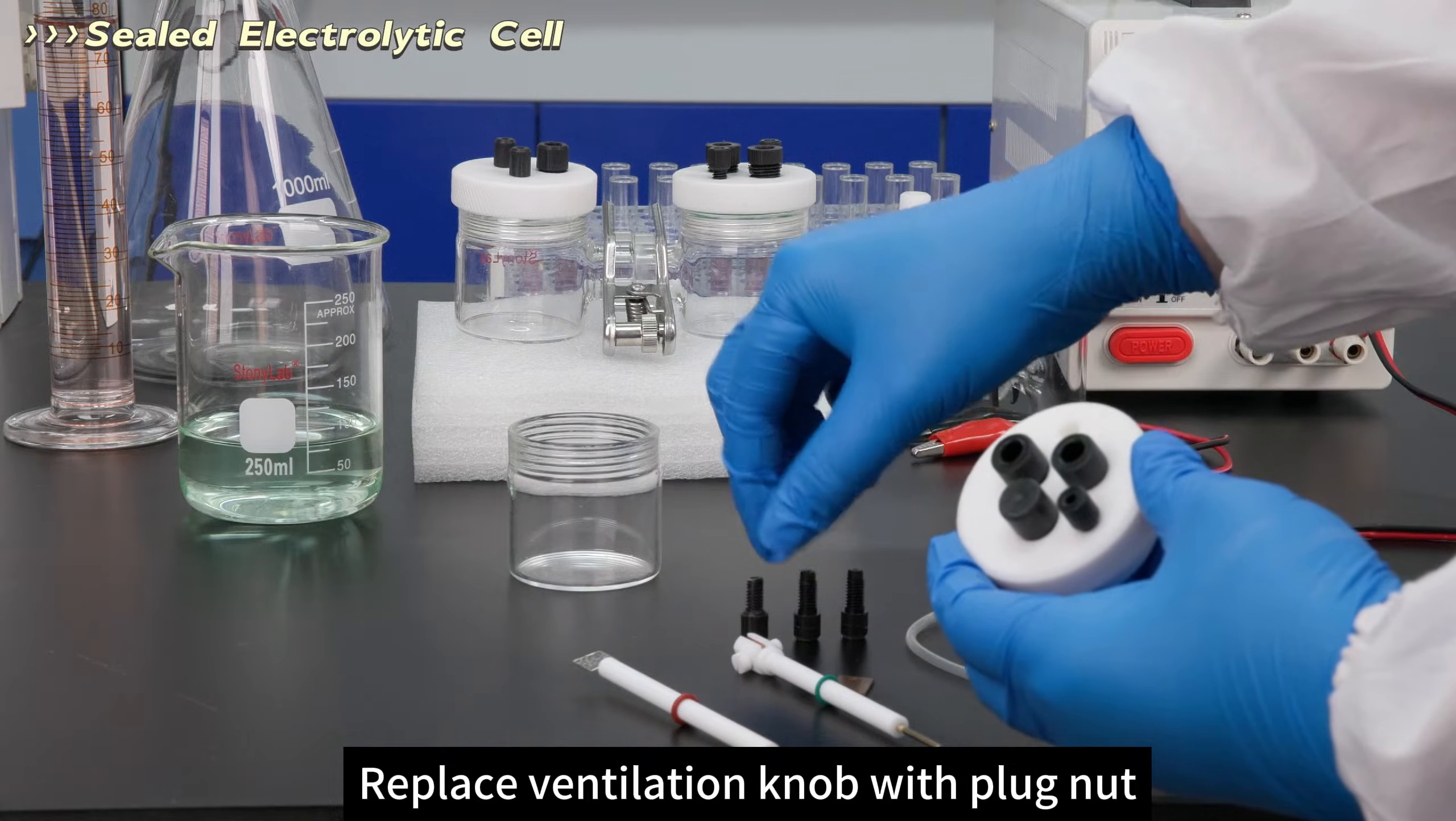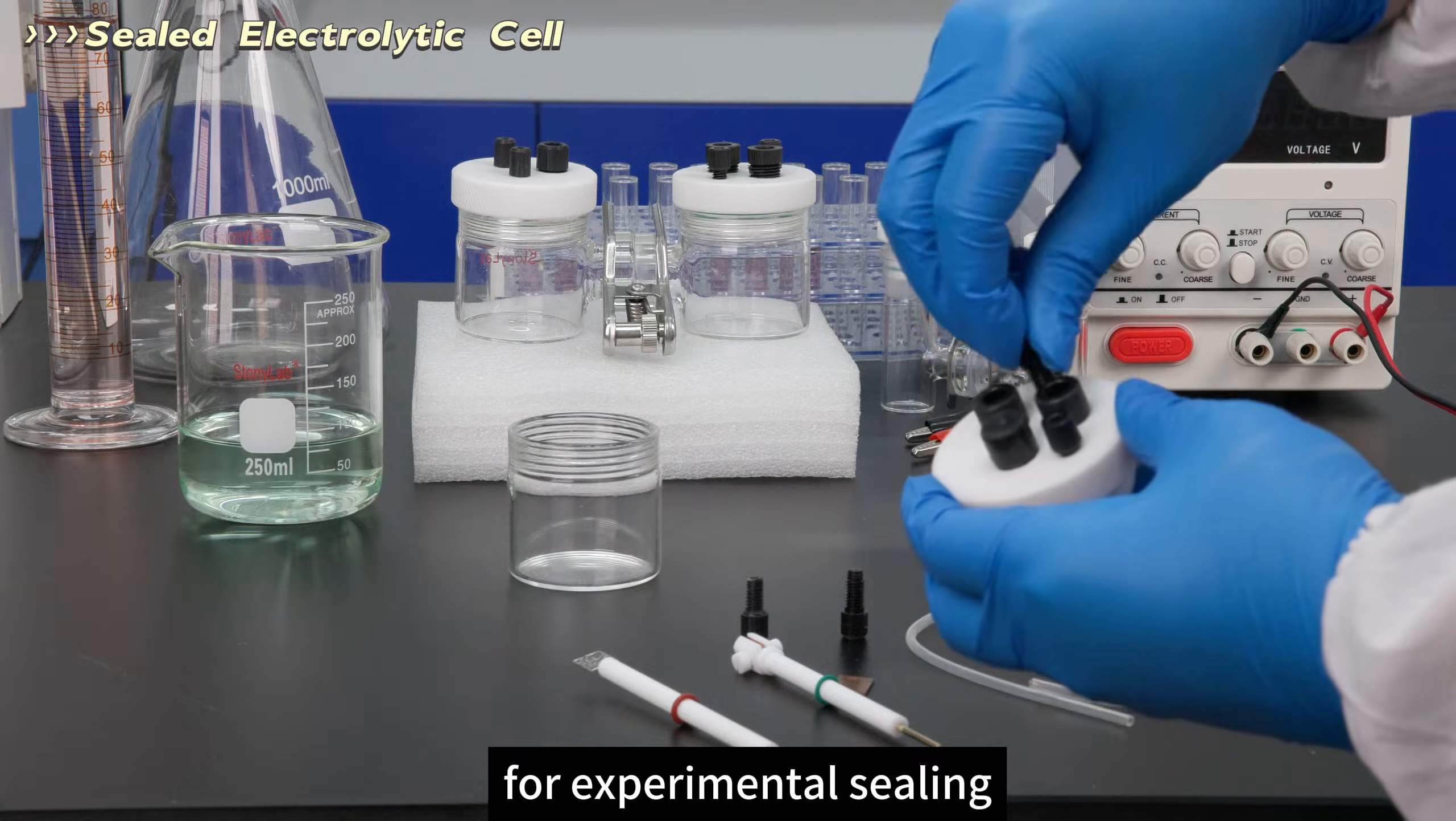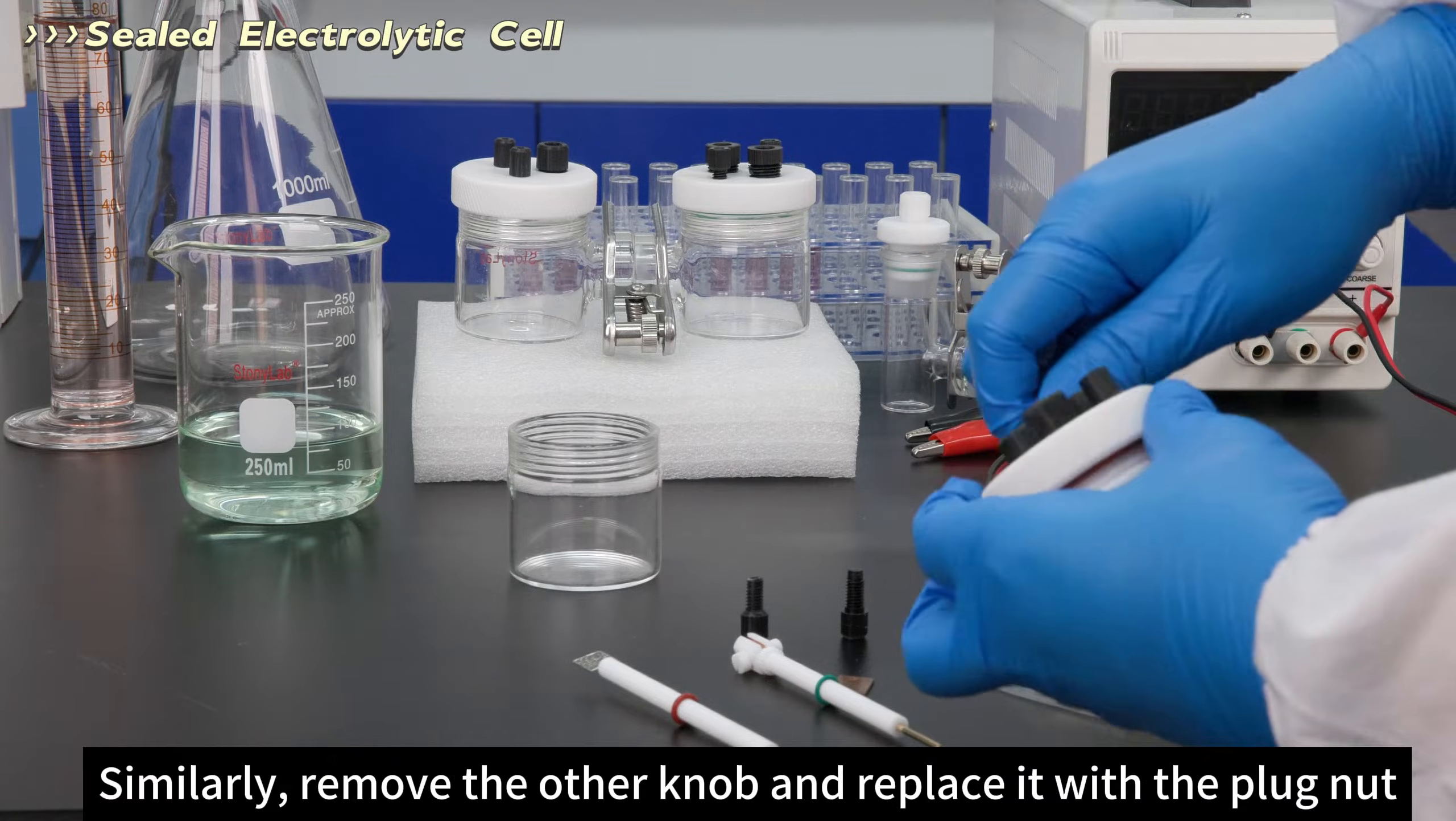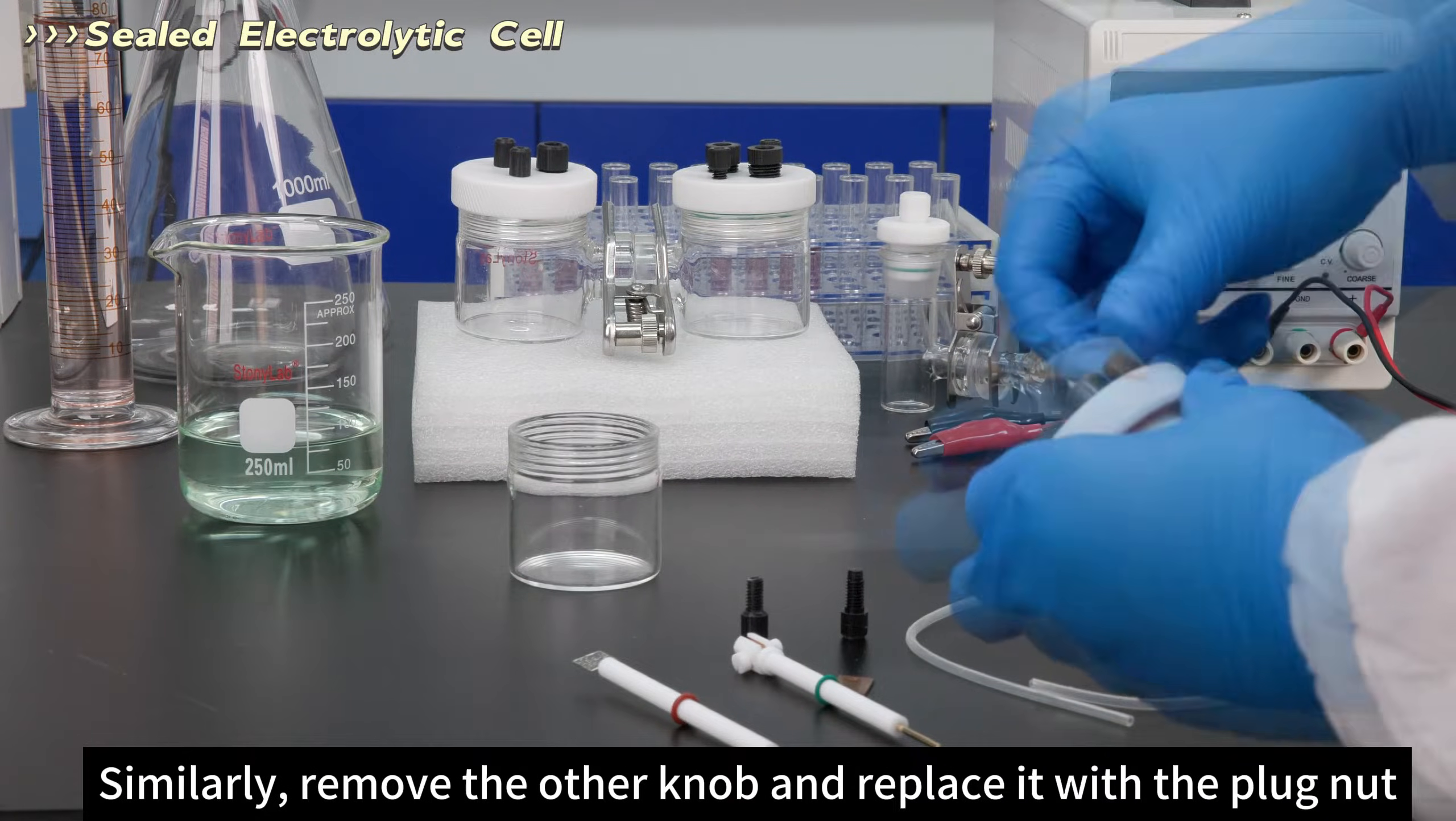Replace the ventilation knob with a plug nut for experimental sealing. Similarly, remove the other knob and replace it with the plug nut.